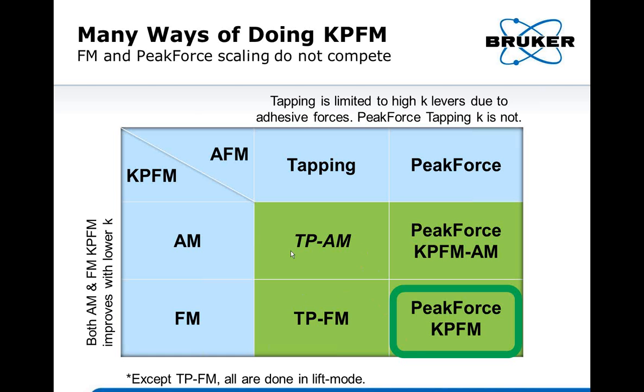The other thing I want to point out is that you have probably heard of lift mode. Except for tapping mode frequency modulation KPFM, all the three other modes are based on lift mode.